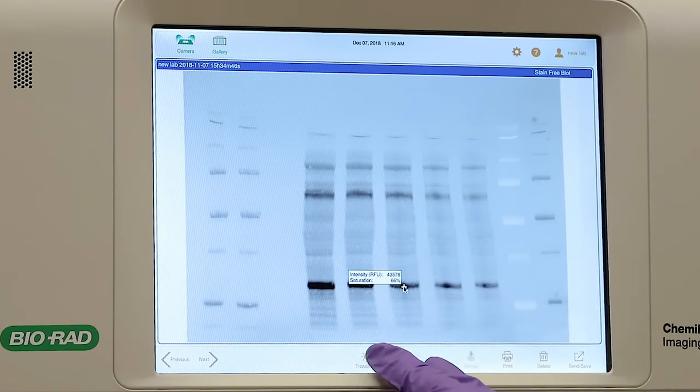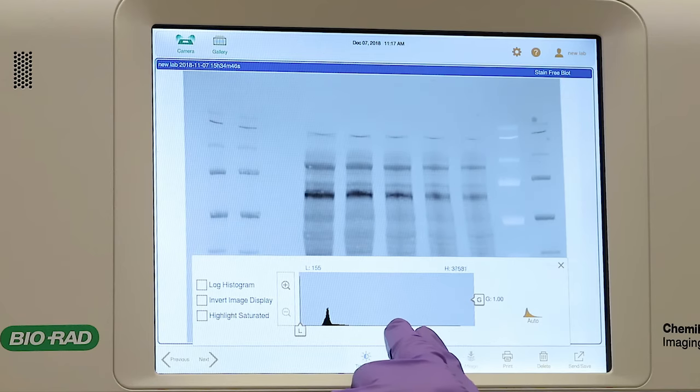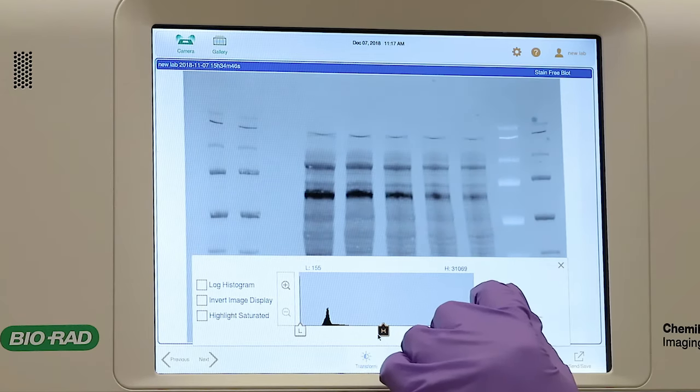To adjust your image, tap the transform icon in the lower toolbar. Adjustments are automatically saved, but the actual data will remain unaffected.